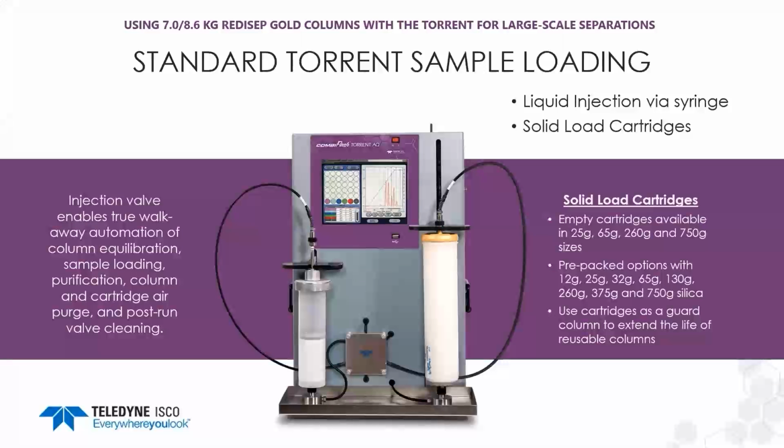For loading, you can do liquid loading, or you could do solid sample load cartridge loading. And so this is obviously a huge advantage. We've talked about this in the past, but solid loading onto the cartridges basically gets rid of any effect from your dissolution solvent, and it can eliminate that for your tough to dissolve compounds.